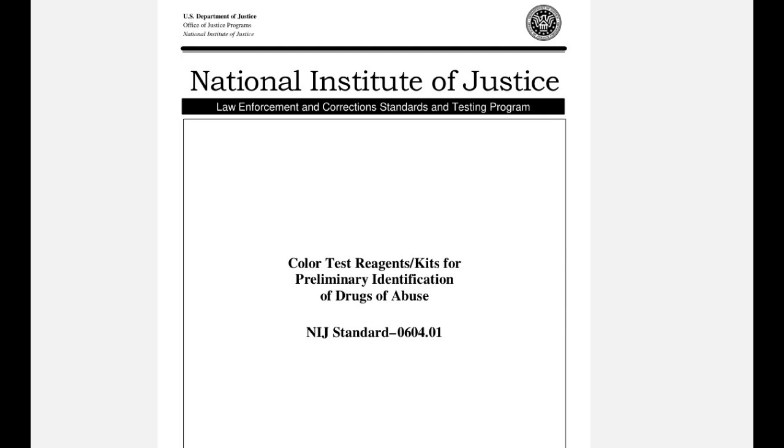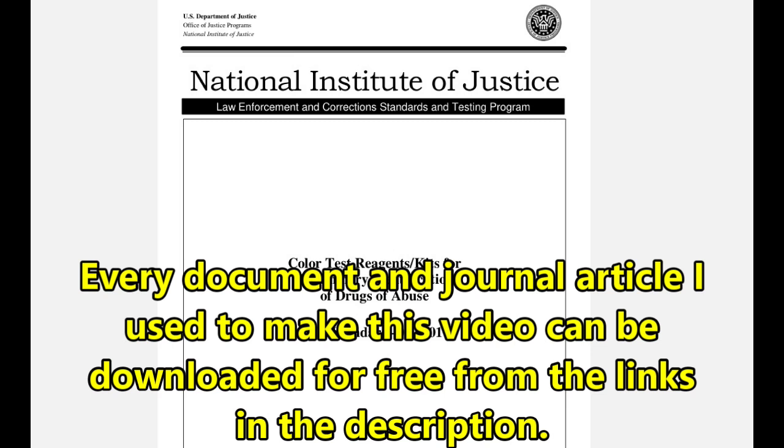In this video, I want to review a very interesting document that I found that details 12 different reagent tests that are used to presumptively identify drugs of abuse, quote unquote. Now, this is something that is used by law enforcement.